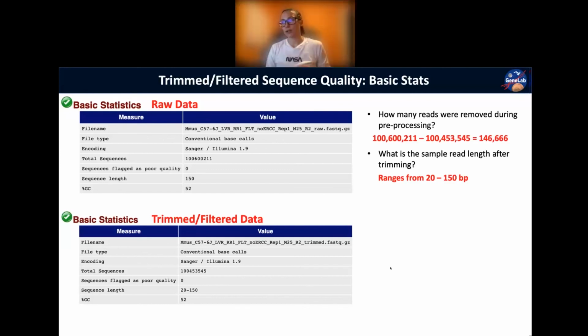We don't actually. We don't do any 5' trimming. That comes at the 5' end. So we only trim from the 3' end, but you can set your trimming algorithm to trim at the 5' end, because it was less than 1% again of the reads that were sampled in FastQC that had that N at the beginning. That's not too concerning. So we don't actually trim from the 5' end. We only trim from the 3' end.